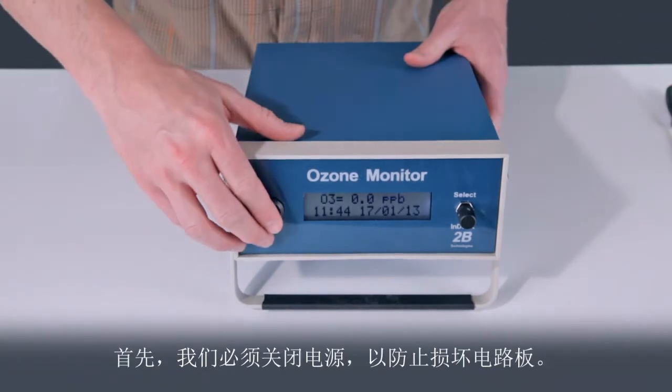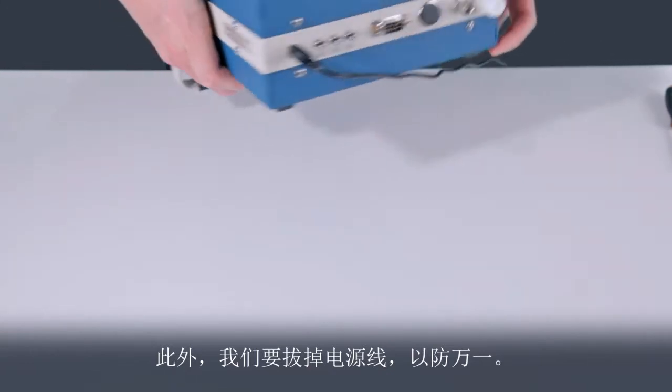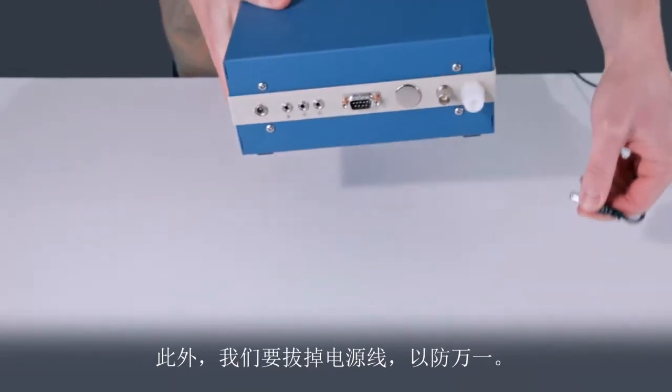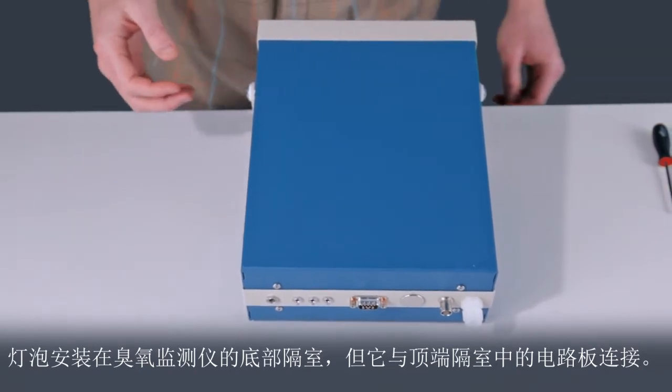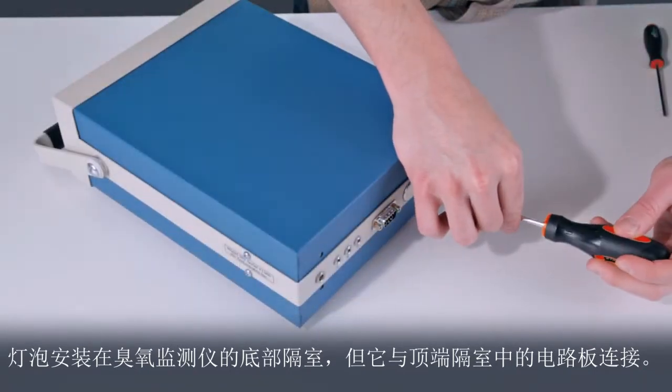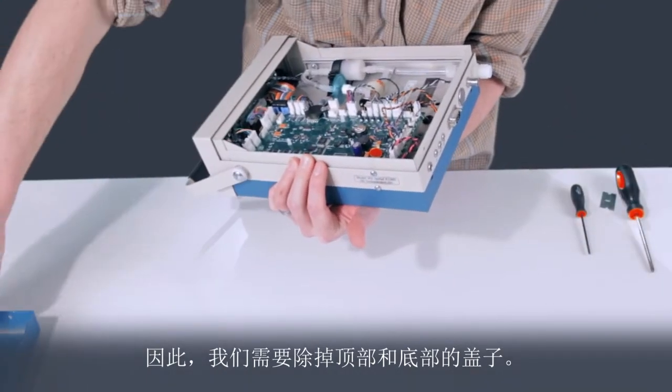First we should turn off the power to prevent damage to the circuit board, and we will unplug the power cable as a precaution. The lamp is mounted in the bottom compartment of the ozone monitor, but it connects to the circuit board in the top compartment. So we will need to remove both top and bottom covers.